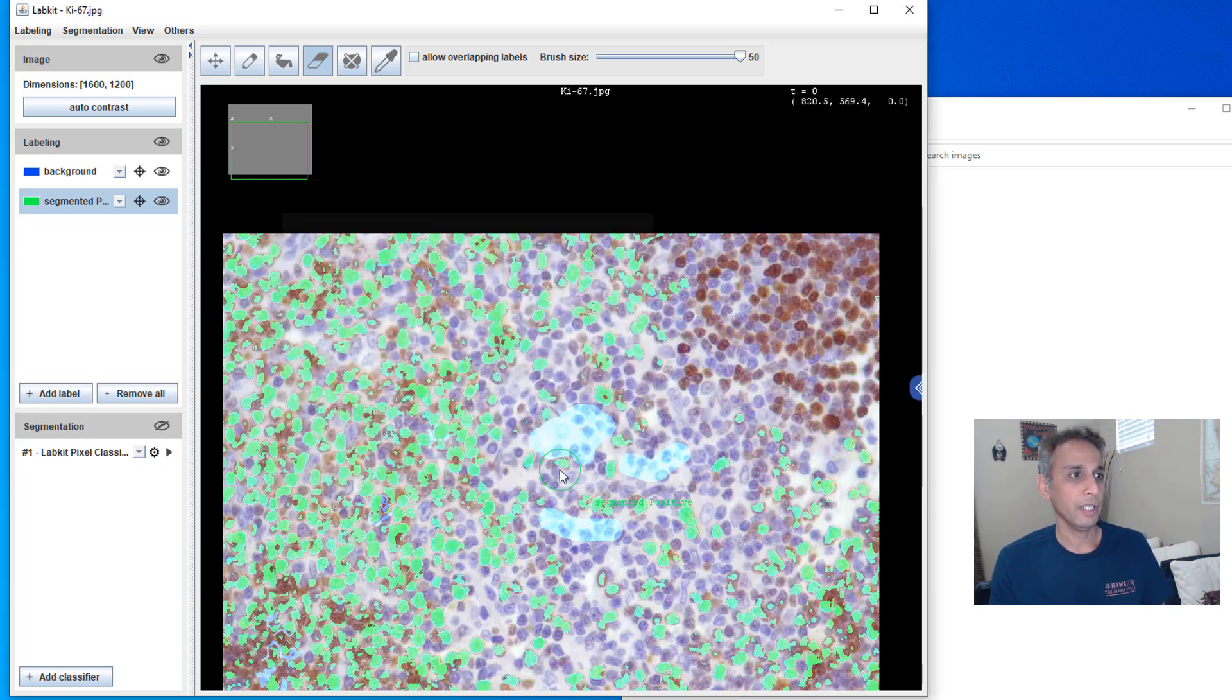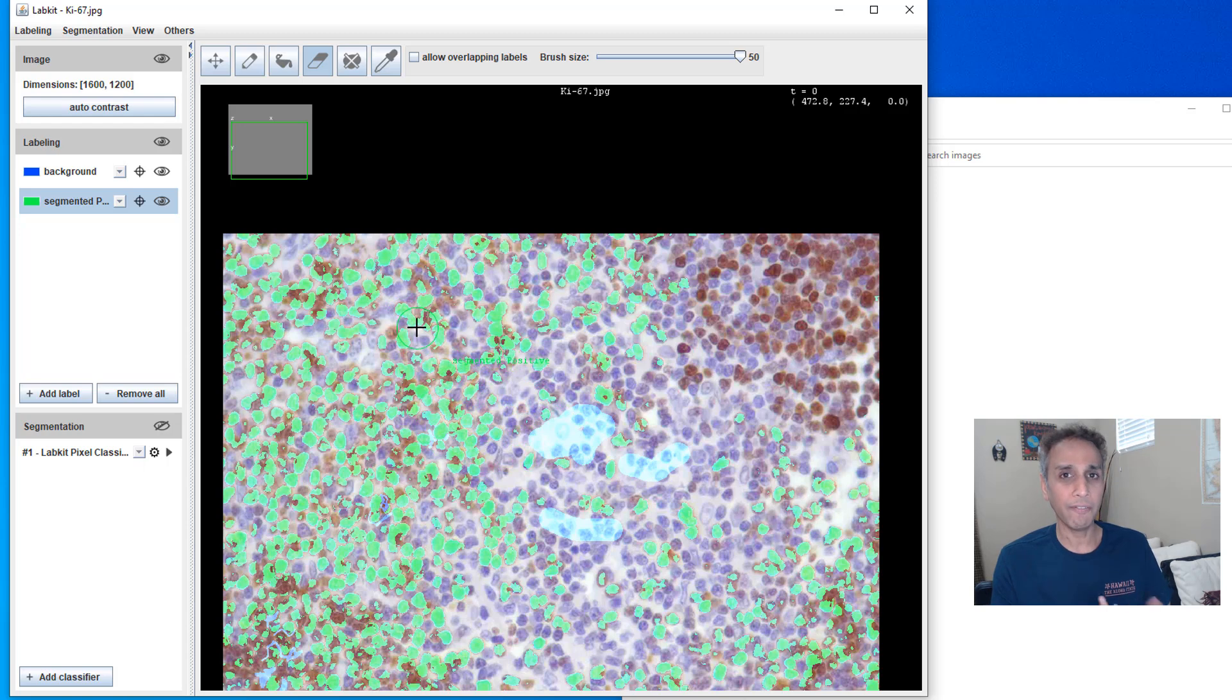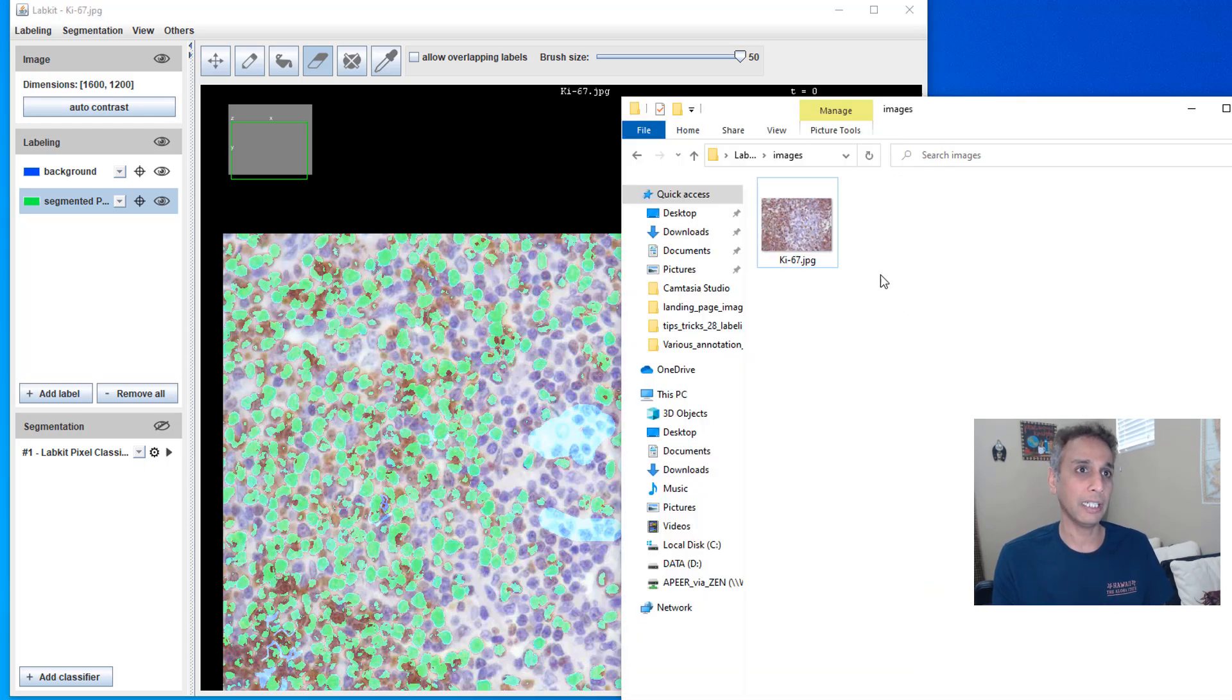Let's go back to our desktop LabKit. And let's just dump it here. My mask. Yeah. And save. And I selected TIFF format. So it's saving this in TIFF.